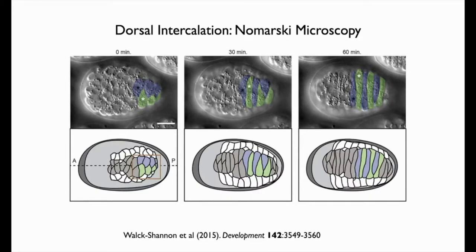Here's a snapshot from a 4D time-lapse Nomarski series, with some cells colorized in green and blue. Initially the cells are not particularly polarized, but they rapidly polarize, begin to directionally migrate, and by the end, as intercalation is over, you get a characteristic alternating pattern of intercalated cells.